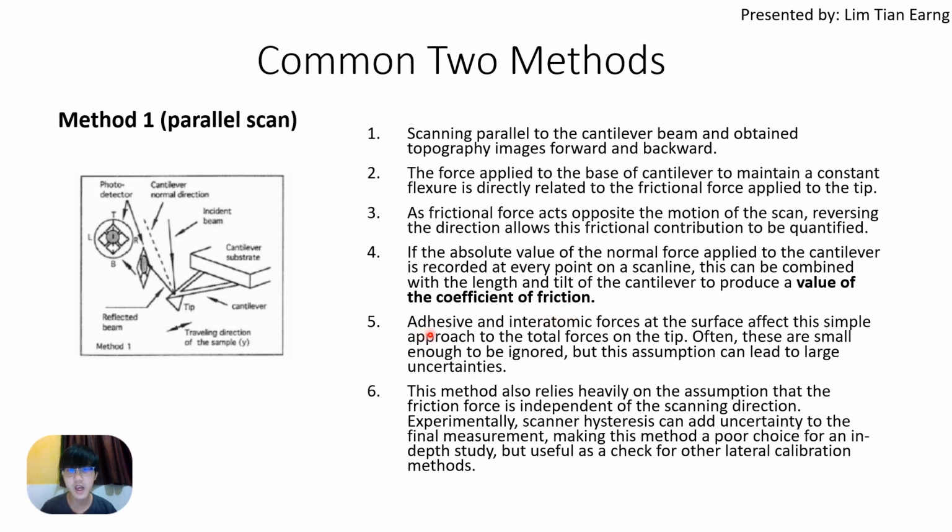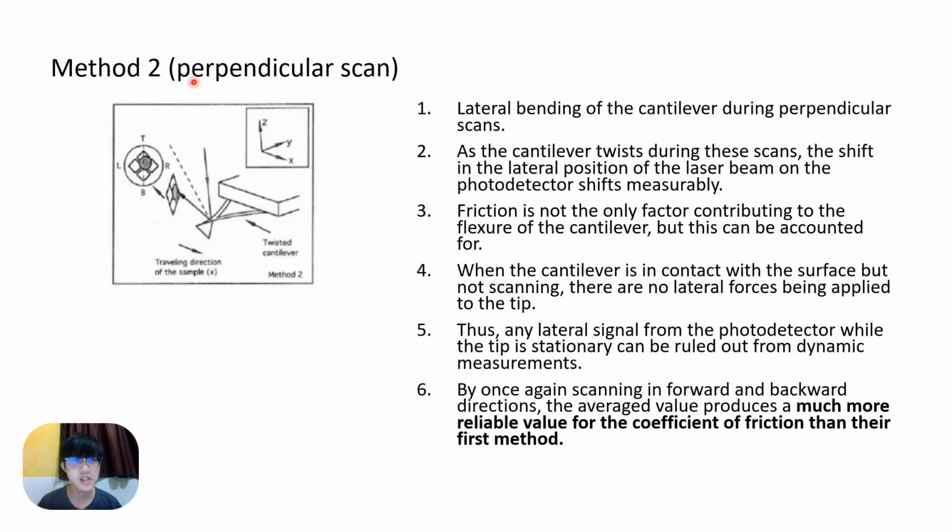From here, the adhesive and interatomic forces will affect this simple approach, so this will make a large uncertainty. So this method is not really reliable. You will have uncertainty. And moving on to the second method, the perpendicular scan.